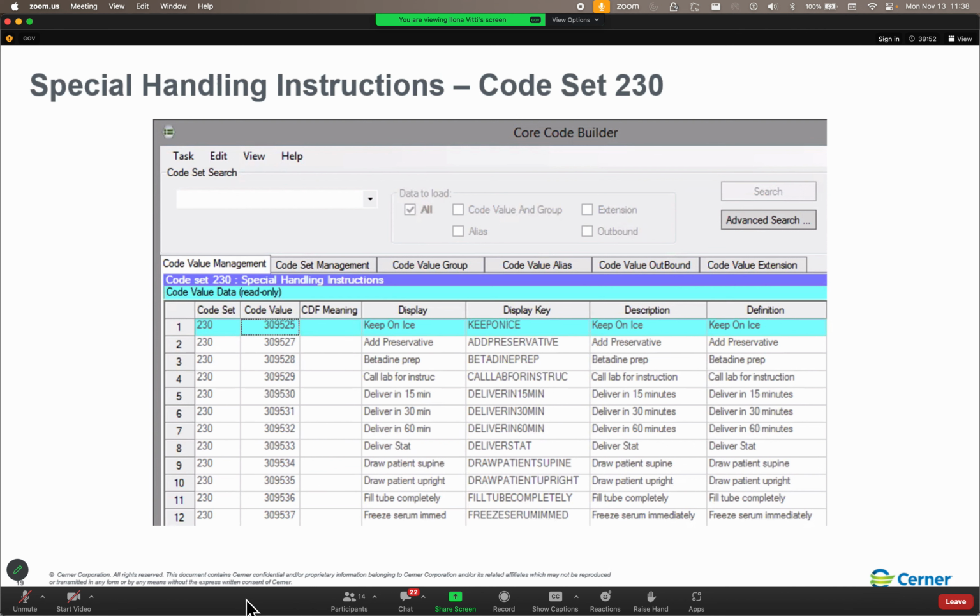So we have a site prefix. Does DHA, do you use all 5 digits on your site prefix? Since I know I've got DHA folks in here, do you use all 5 digits on your site prefix? Four. Okay. So you've got a site prefix that's 4 digits. So 1, 2, 3, 4, 23, 317 for today, and then 0, 0, 0, and 6.